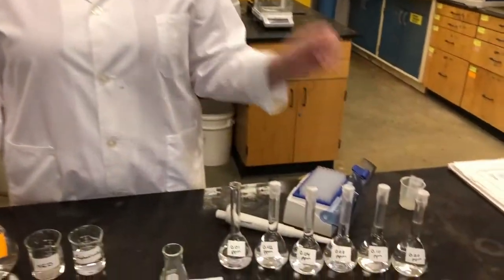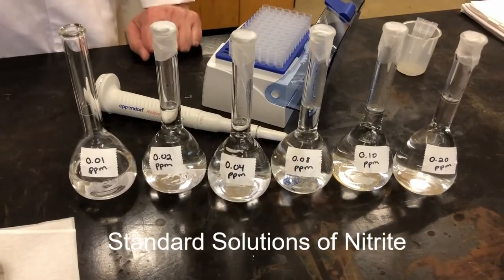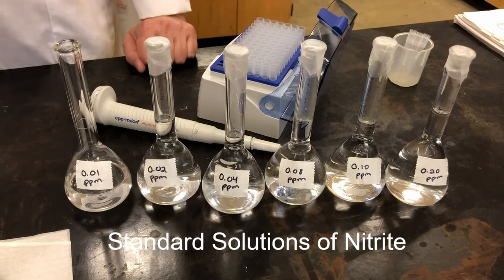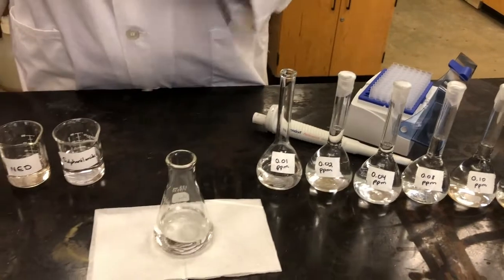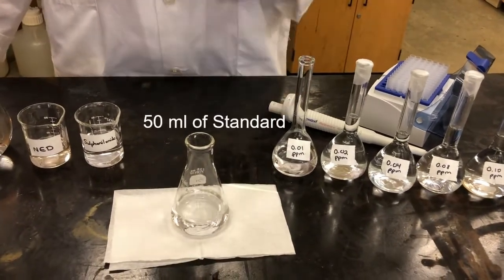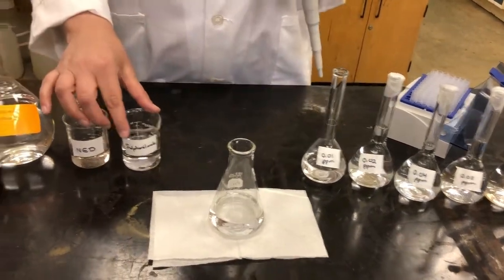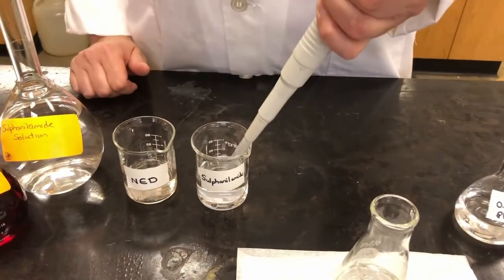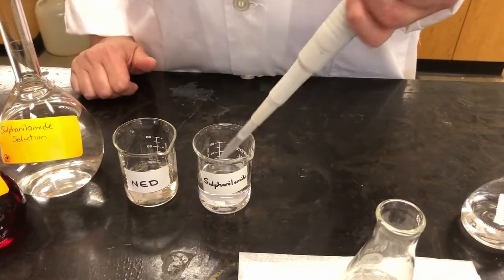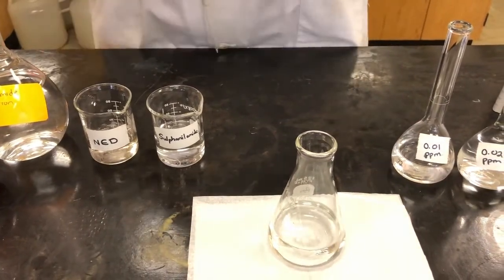So we have a variety of samples here from 0.01 ppm all the way up to 0.2 ppm that we're going to use for our calibration curve. We're going to start with the lowest, the 0.01 ppm, and I already have 50 milliliters of that standard measured out in this Erlenmeyer flask here. The first step is to add the sulfanilamide, right here. We're going to add 1 milliliter using an Eppendorf pipette. So just 1 milliliter of the sulfanilamide to the 50 milliliters of the standard.